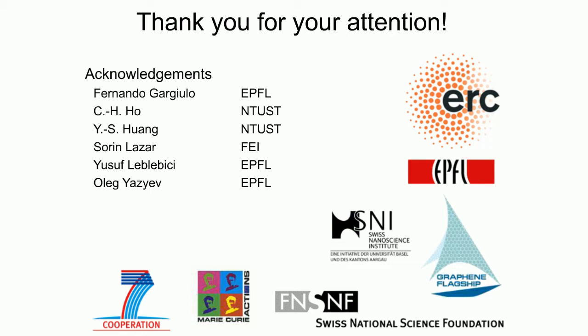Something like one of these table stables that the Swiss company makes. Their distributor here is Herzan, but I forget, JRS, I think. They're really good. Those are the ones we use. I prefer their AVI series, but those guys do a really good job of isolating acoustic noise. And of course, there's passive. Some instruments do real well with just bungees or something like that.